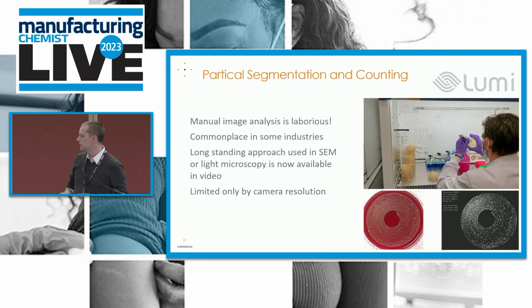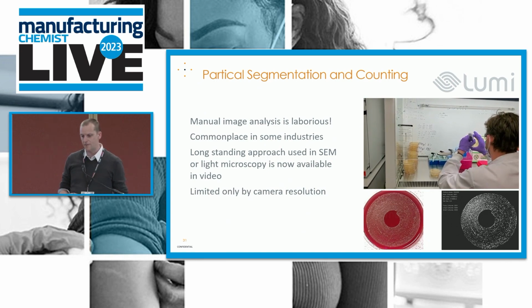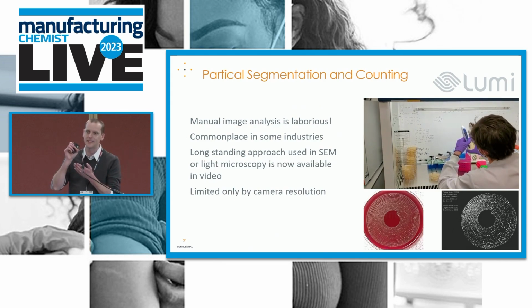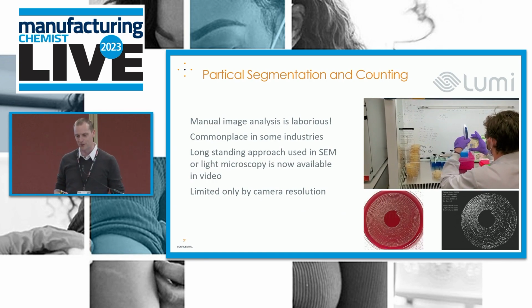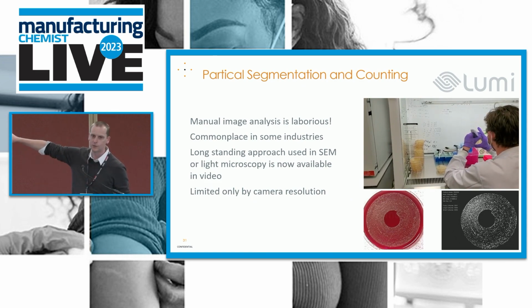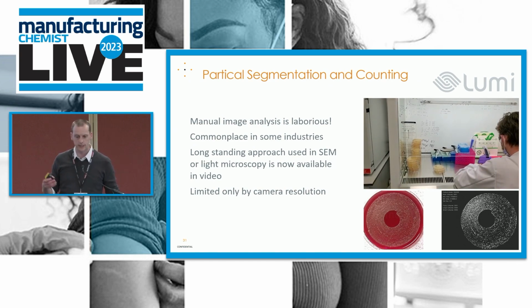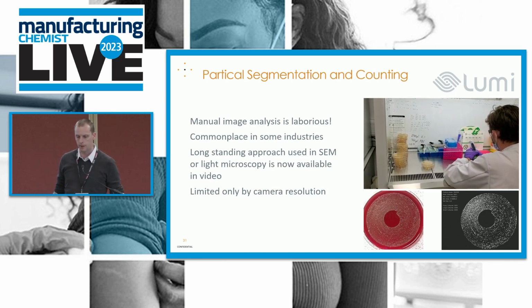And then the final example. This is particle counting, and if you watch this scientist, I think they feel like they've already digitized the problem, because they have a counter every time they press the dot that they're counting those cells. That counts, and that was a distinct improvement over, I'm sure, times gone by. But it's still an extremely laborious process. You can see the number of Petri dishes they've got to work through on the left-hand side. Nobody wants to do that job. It takes a long time. It's prone to error. Let's just do particle counting, using algorithms which have been around for, I assume, decades in microscopy, for example, but available in video and available routinely.